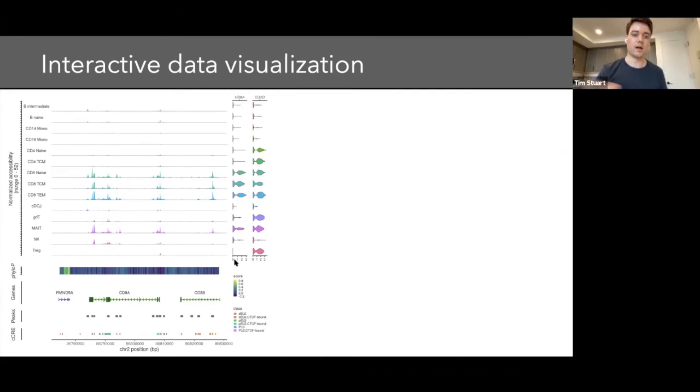We can also layer in other data that we might have for different regions of the genome. Shown here below is data that's being pulled from a bigwig hosted on UCSC, which is showing the PhyloP conservation scores per base. So we can see, for example, this region of the genome is highly conserved between different species.